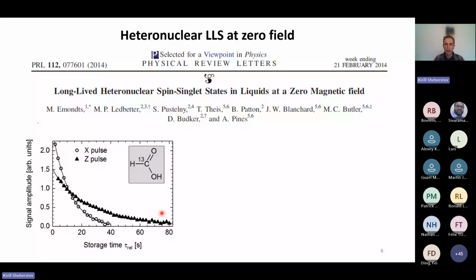The fast relaxation corresponds to redistribution of populations within the triplet manifold, and the slow relaxation mode corresponds to redistribution of the populations between singlet and triplet states.